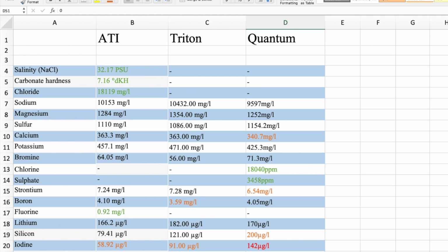I know after the last time I had people tell me that if I have 2 results come back at 400 and 1 result come back at 200, how can I say that the result at 200 is wrong? It could well be the 2 that are 400 are wrong. Absolutely, 100%. Couldn't agree more. That's not how I've scored it here.